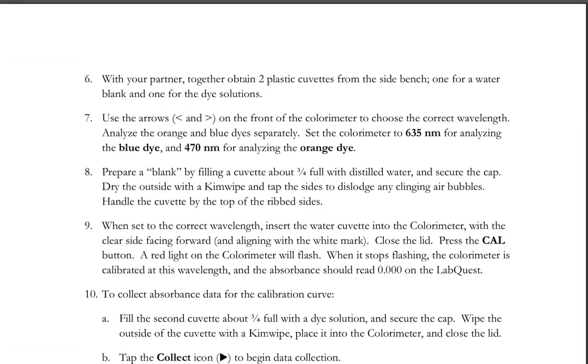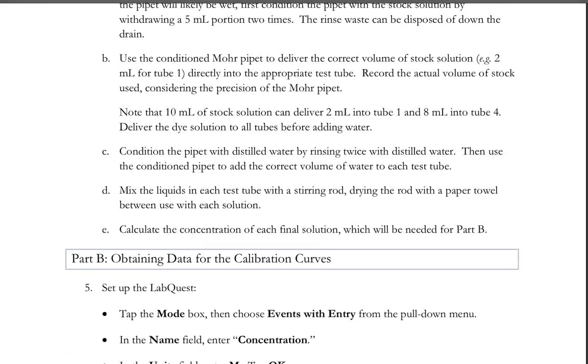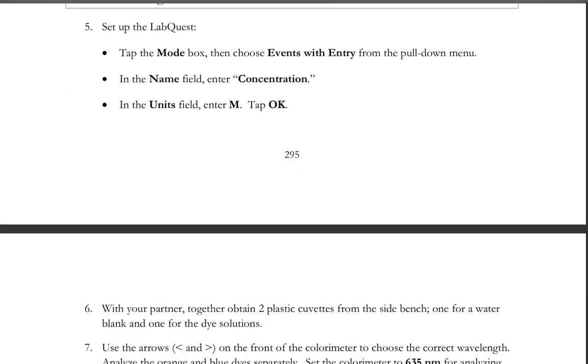So we are told to prepare those dilutions, which will be shown to you in the experiment video, and then we are setting up our LabQuest. The mode is events with an entry, so the one that the spectrometer takes, that's the absorbance. We enter then the concentration, which is why we need the concentrations early on. Our unit is molarity for concentration.